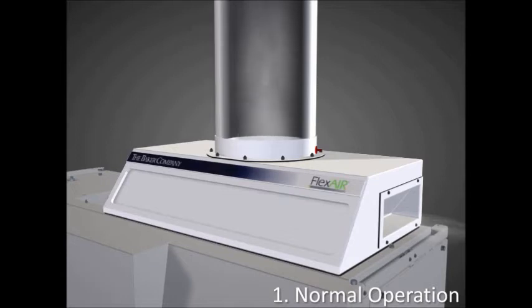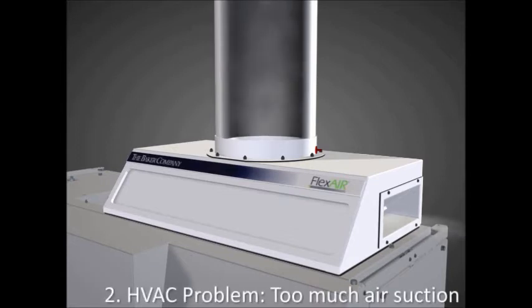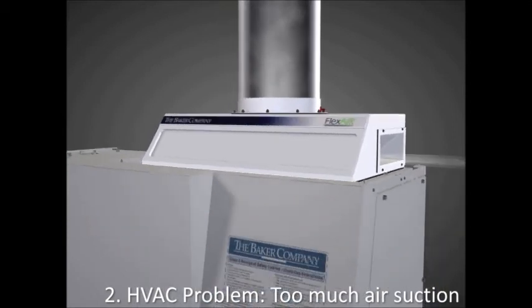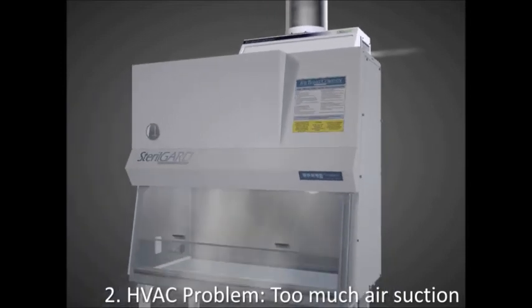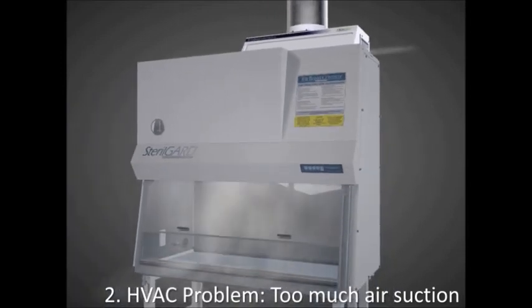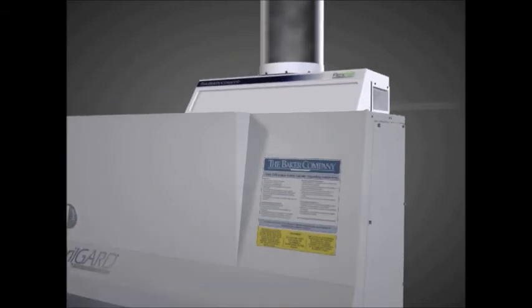The FlexAir also ensures product and personnel protection during building exhaust system fluctuations. If there is too much suction and the building exhaust system attempts to pull in more air than is exhausted by the cabinet, the side dampers will open to allow room air in, thus enabling the cabinet to maintain the required intake airflow at its front access opening. Product protection is not compromised.